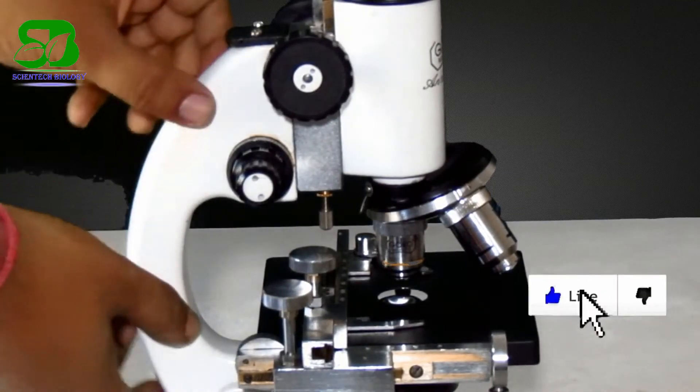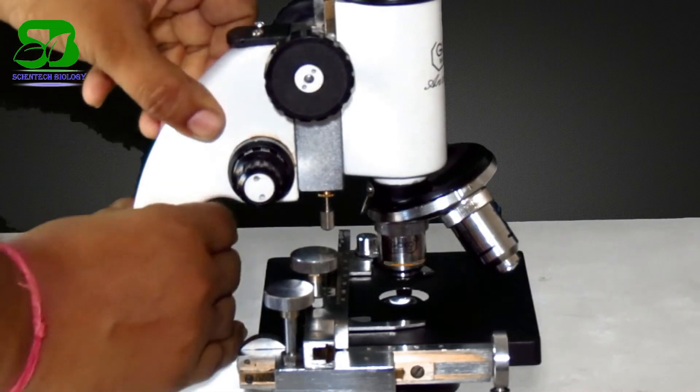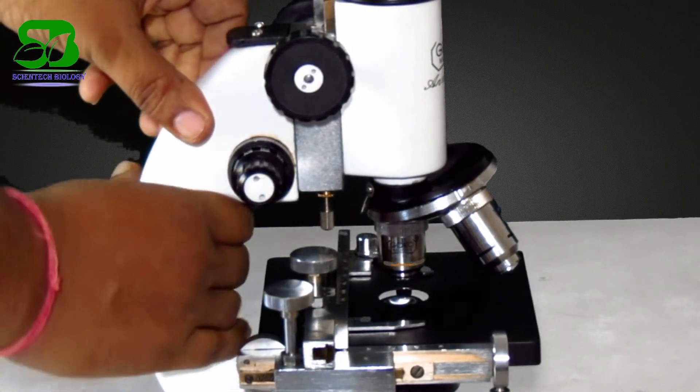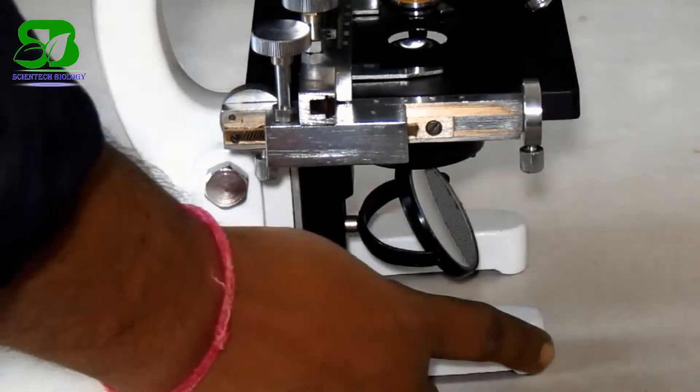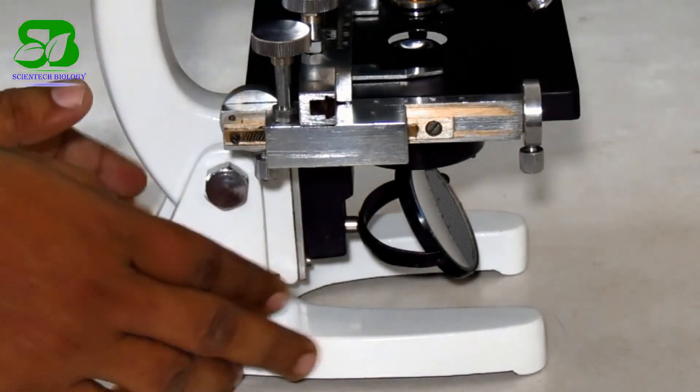This curved part of the microscope is called the arm and it holds the body tube and the stage. Here at the base is the supporting stand that rests on the table for support of the microscope.